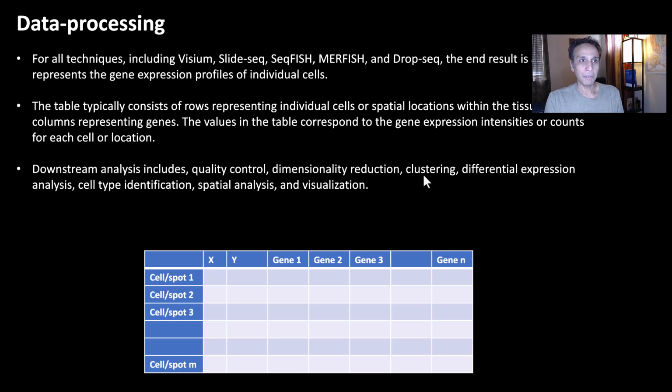And you need to perform clustering. Once you reduce the dimension, you can cluster all of these, but trying to interpret that without reduction would be a nightmare. That's why you do the dimensionality reduction and then do the clustering. In fact, if you reduce the dimensions to only 2, which we'll be doing, then you cluster on a 2D plot, you can identify multiple clusters, and then you can do cluster analysis. Once you have multiple clusters, you can do differential expression analysis, meaning which of these genes are differentially expressed compared to the rest.